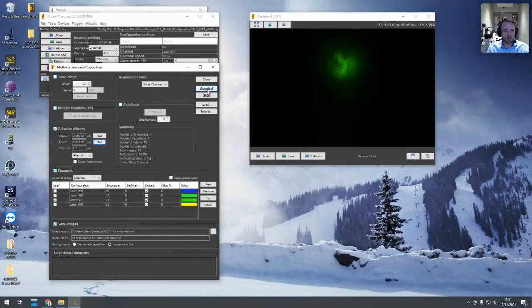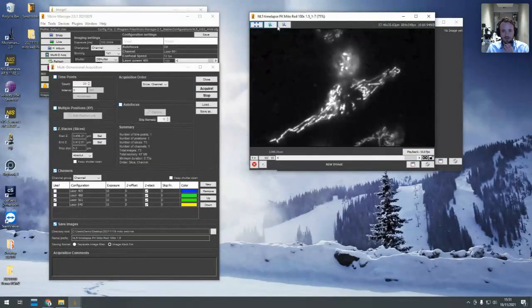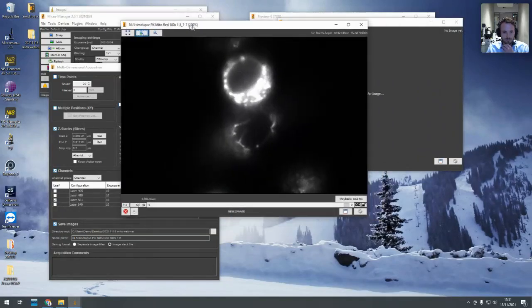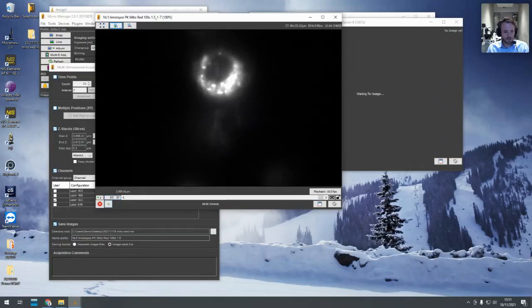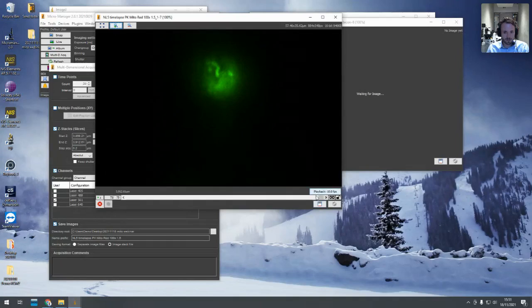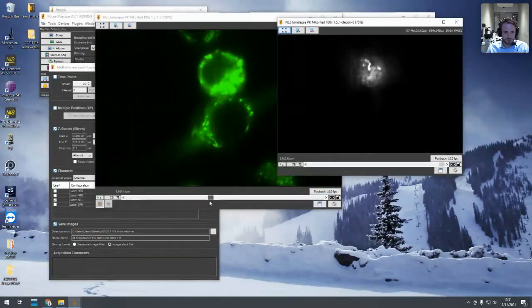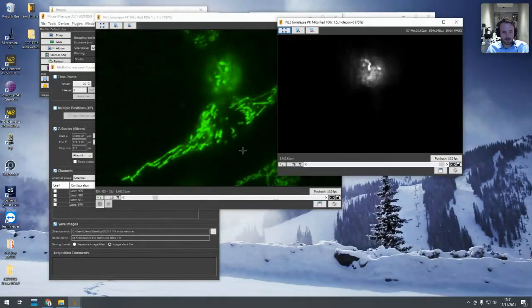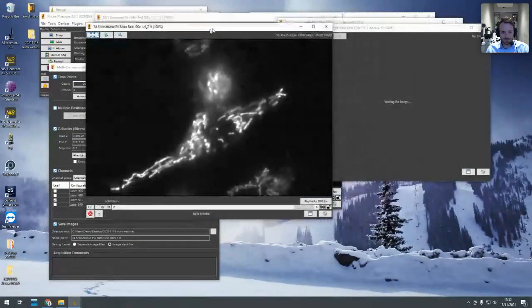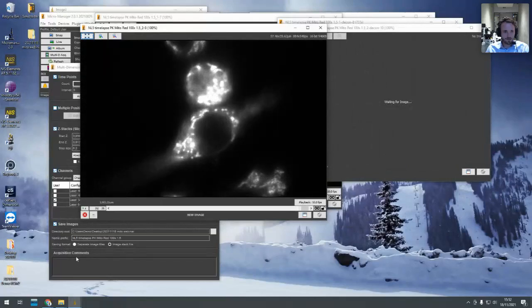And while they're being acquired, they're automatically being deconvolved. So this is something I could show you while this is actually acquiring, so you can see the data coming in. It's happening quite fast. I'm not using a piezo stage here, so it's a regular microscope focus, and that gives me 10 slices a second or something like that. And we can do that over time as well. So let's do 20 time points. Sounds good, reasonable. So it's acquiring it.